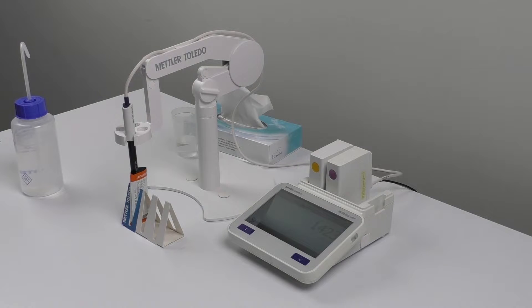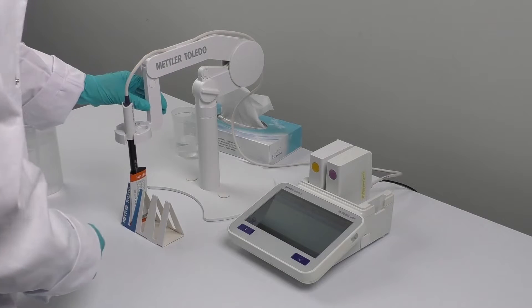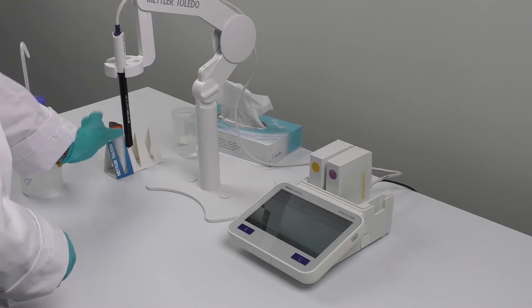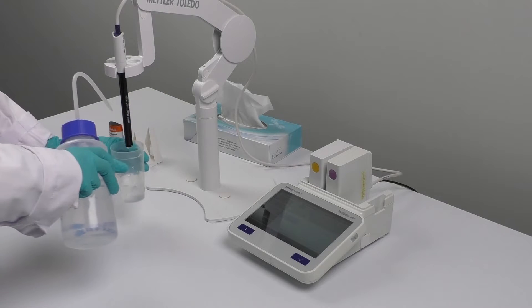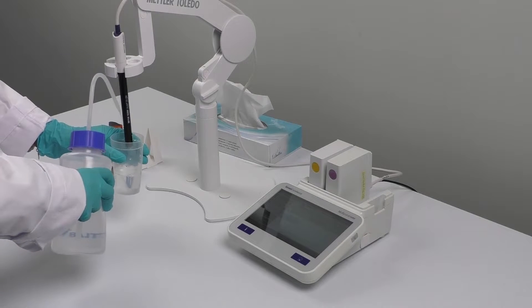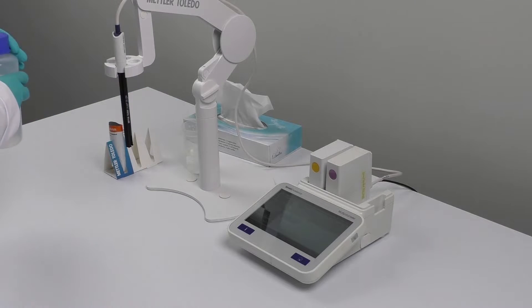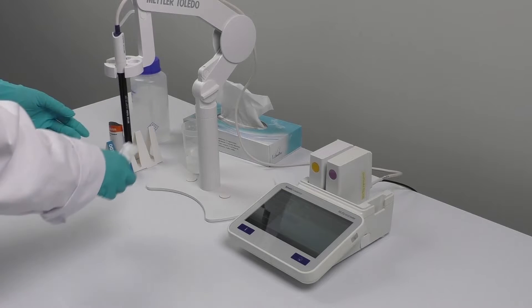Once you have completed the calibration process, you can see the cell constant value on the meter. Just click 'Save' to save the newly generated cell constant. Then remove the sensor from the standard, clean it with deionized water, and dab it with a tissue.